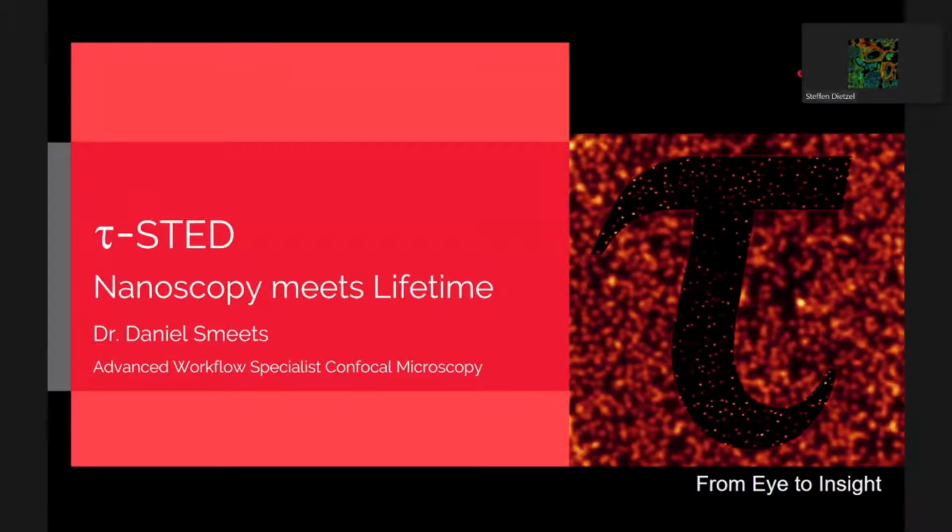Daniel has already prepared a talk for that, of course, because he's the specialist from Leica concerning this topic. So that's very nice for us, so that we don't have to think about it too much, because we got the talk presented here. And also he will then present some data. This will be a combination of talk, of a live session, and of recorded sessions. One of the reasons for the recorded sessions is that right now, under Corona conditions, it's maybe not recommended to cram too many people into one room. The other reason is that we will see some live cell data, and for that we would have to heat up the microscope from room temperature to 37 degrees. That takes quite some time, so we couldn't do it all in one session. So that's also then a recorded part.